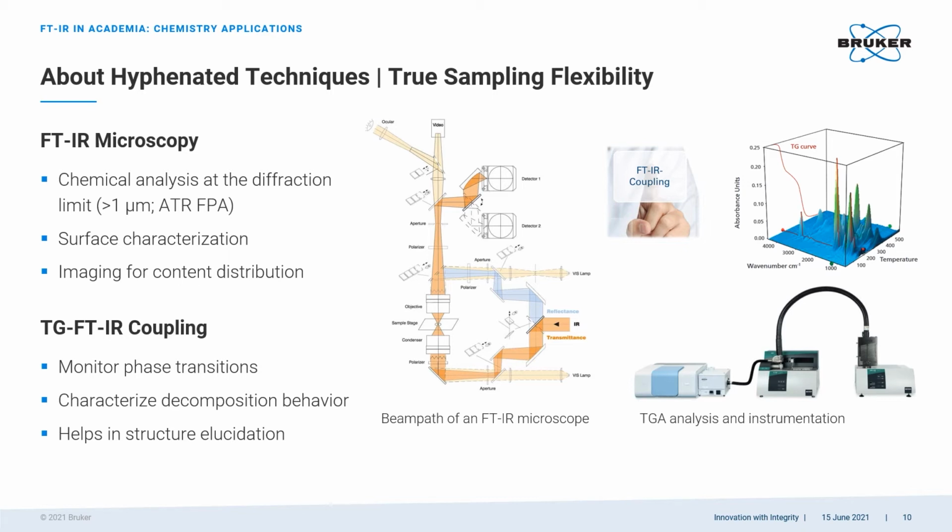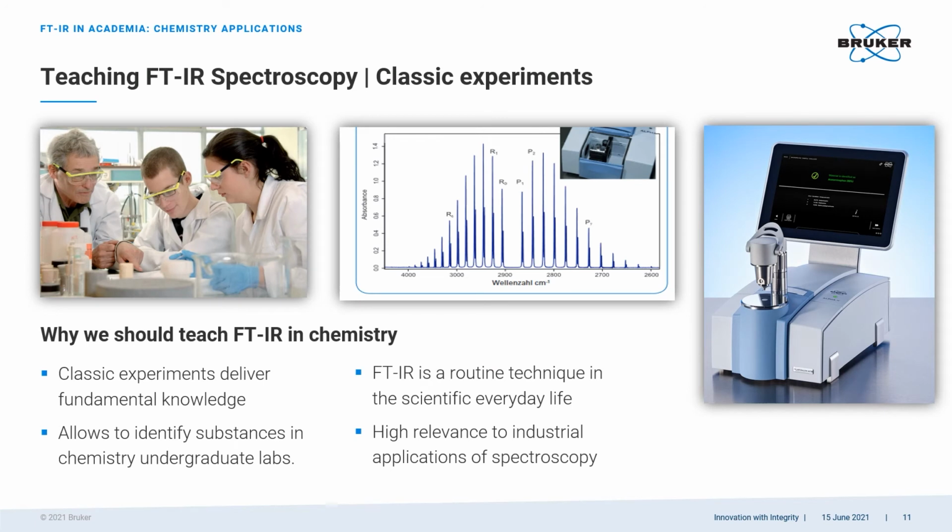and I hope we can dive into this topic a little further along the way when we talk about the actual applications of FTIR. Now, before we end this introduction into FTIR spectroscopy, I think we should briefly talk about teaching FTIR. Well, why, you may ask? Well, simply because it is easy to forget why infrared spectroscopy is such a vital part of a chemistry syllabus.